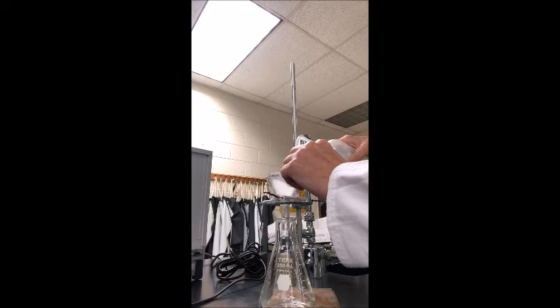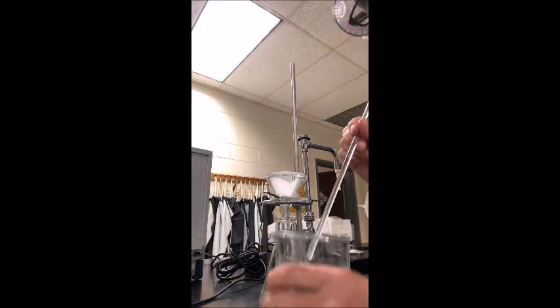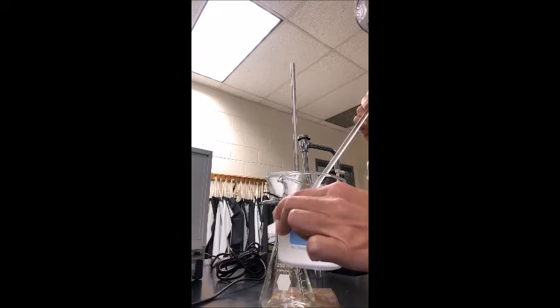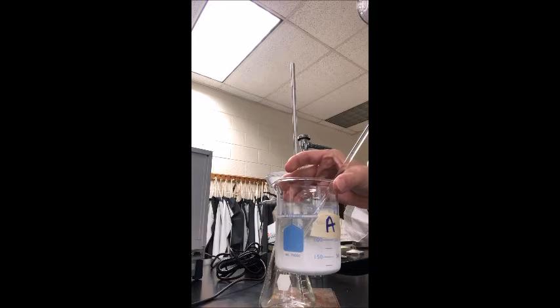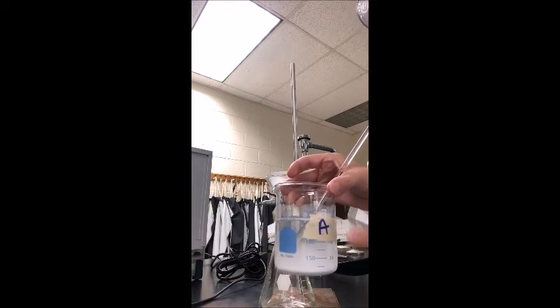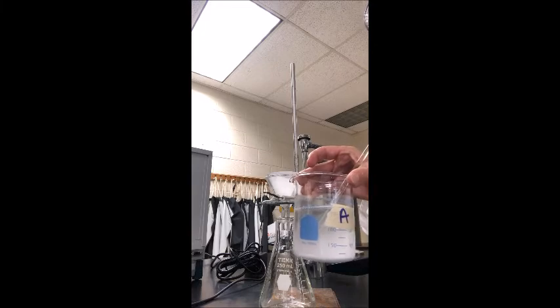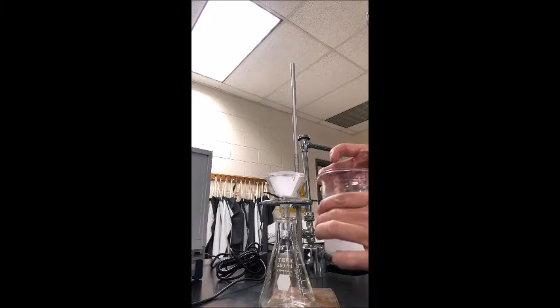So when I'm ready to start pouring my A in there, now I let it settle for a little while. As you can see, some of the precipitate fell to the bottom, and you can see that nice layer of precipitate at the bottom. Put my hand on the back of the beaker here. So you can see it's still a little cloudy in some of the liquid, but what we're gonna do is we're going to filter the liquid first, and then when it gets down to almost being near that layer, we're gonna swirl it around and keep filtering.